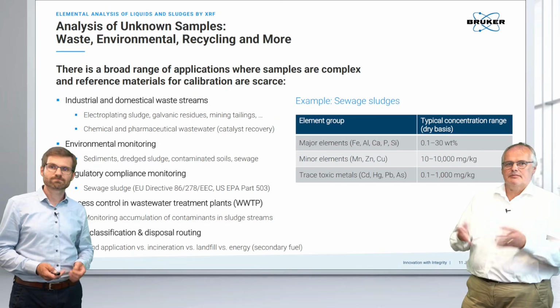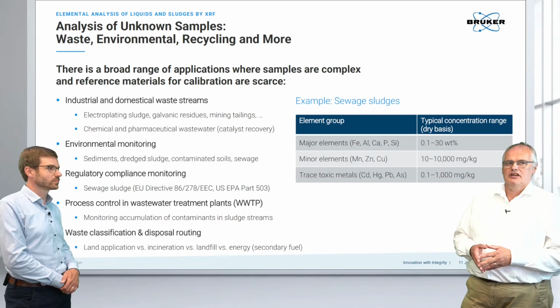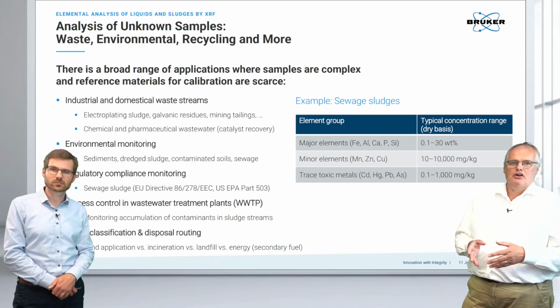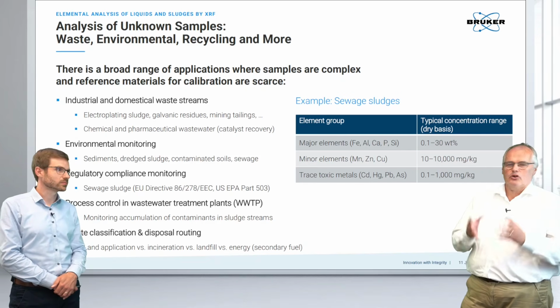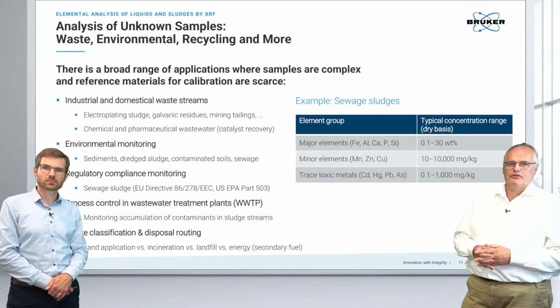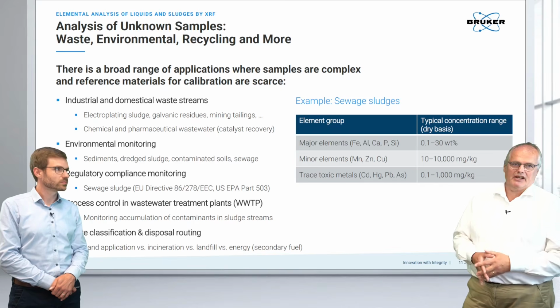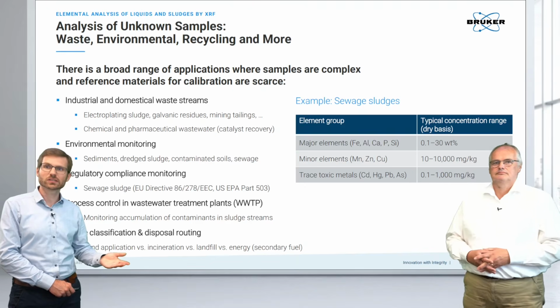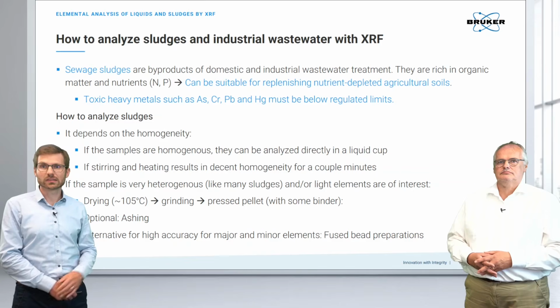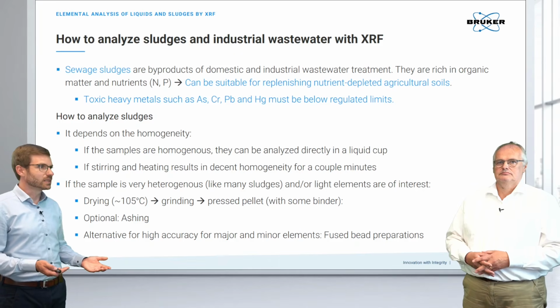The basic difference in this application compared to the first ones is that you are dealing with surprise packages, meaning getting soil or waste from somewhere. There could always be something in it that you don't expect. That's quite different to the application before. So we need to be aware that we need to monitor a large number of elements. But you always need to decide: can you use it for this application or not, or is it too toxic, for example? And in terms of the preparation, again, it depends a bit on your application needs.